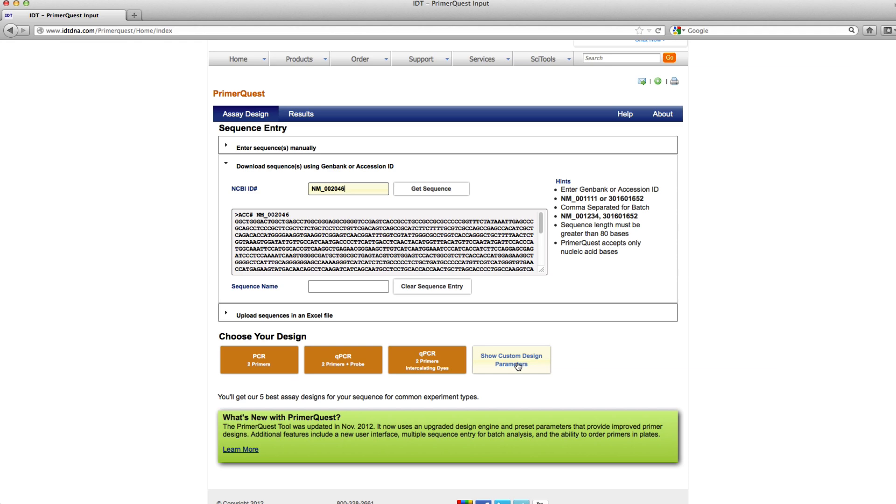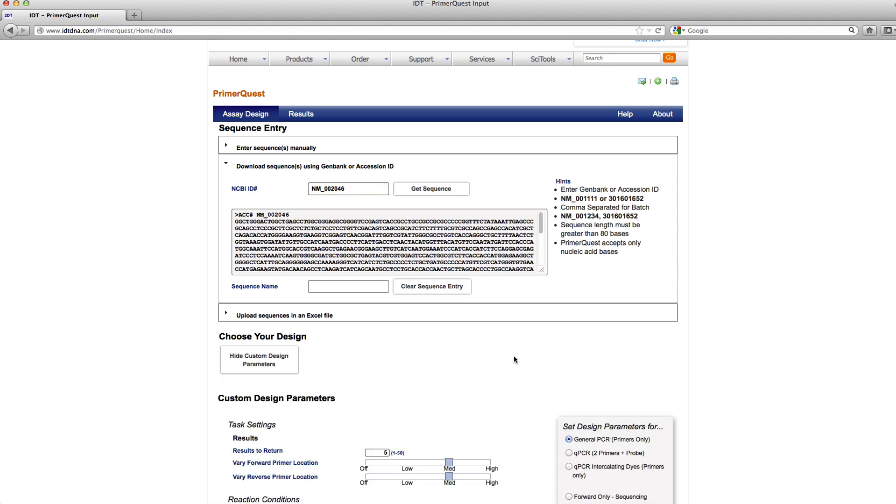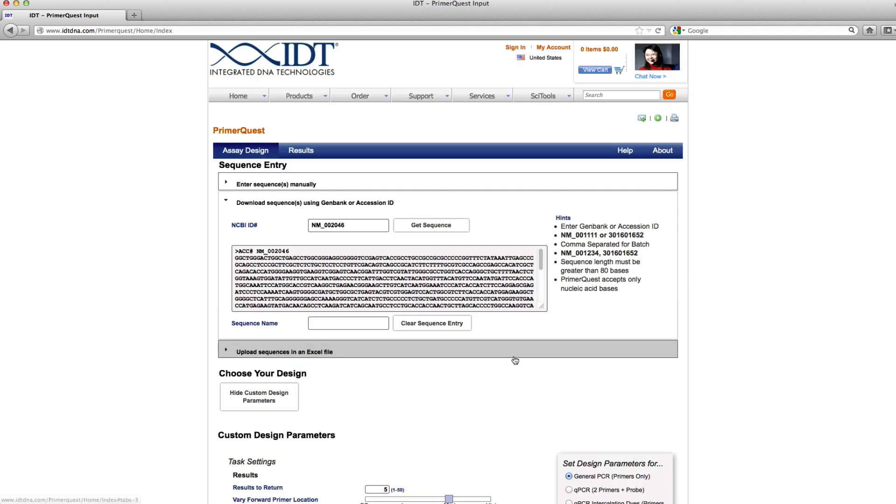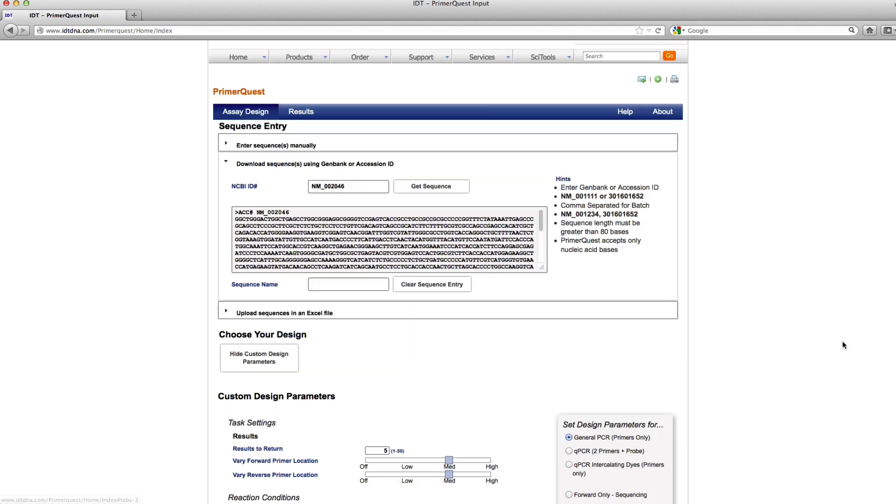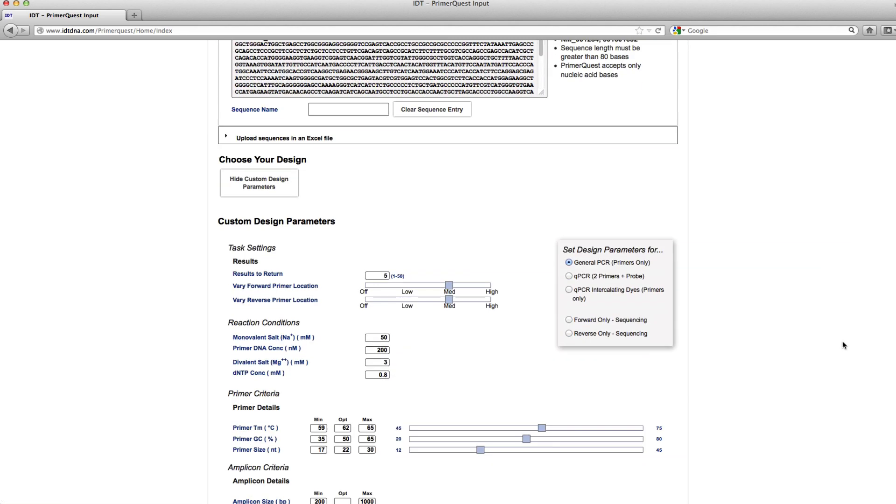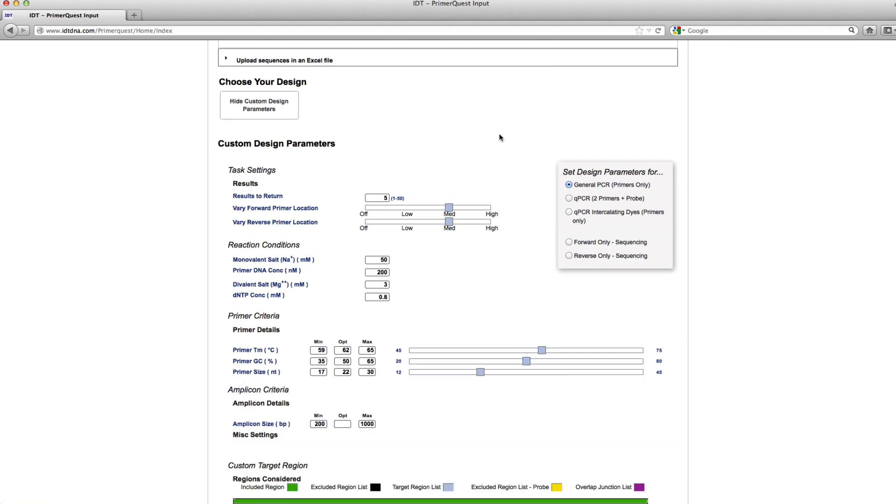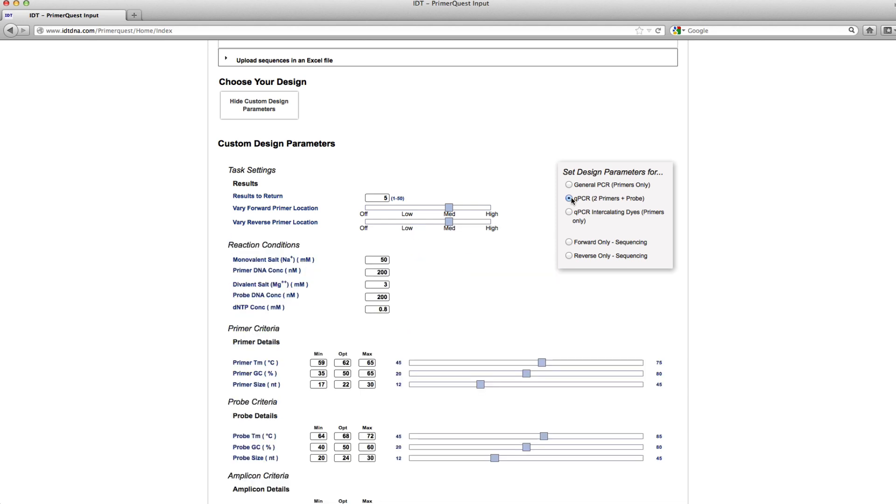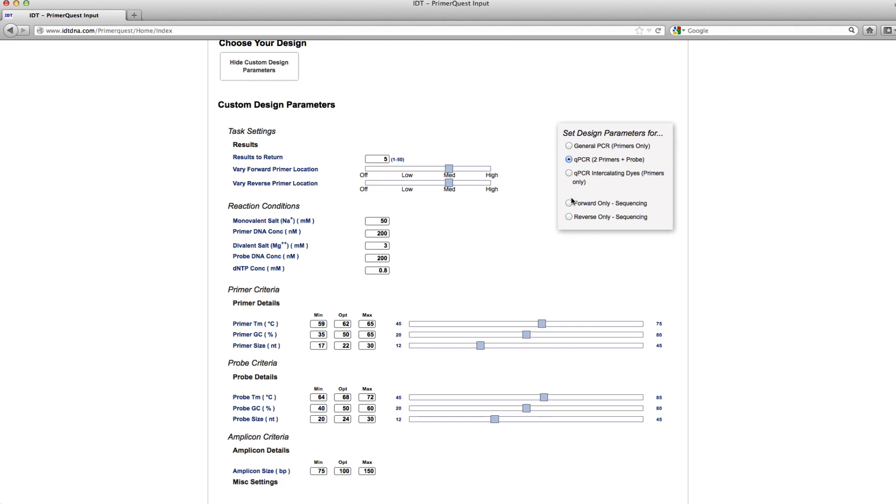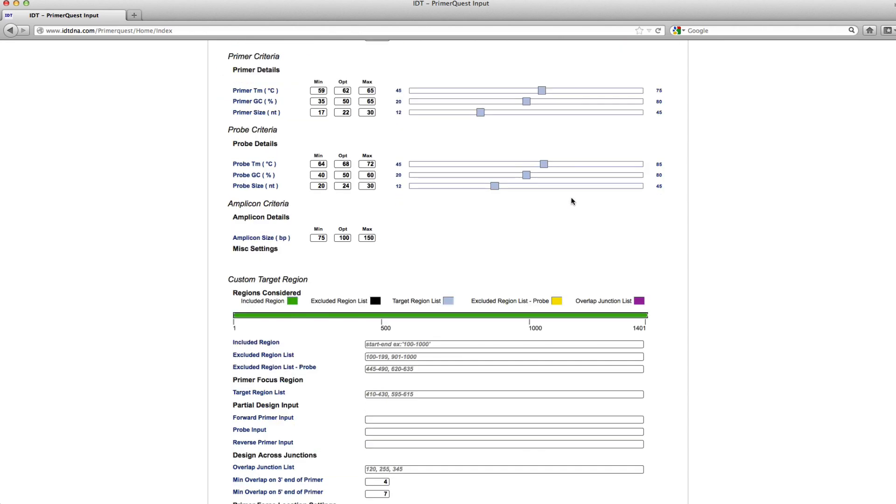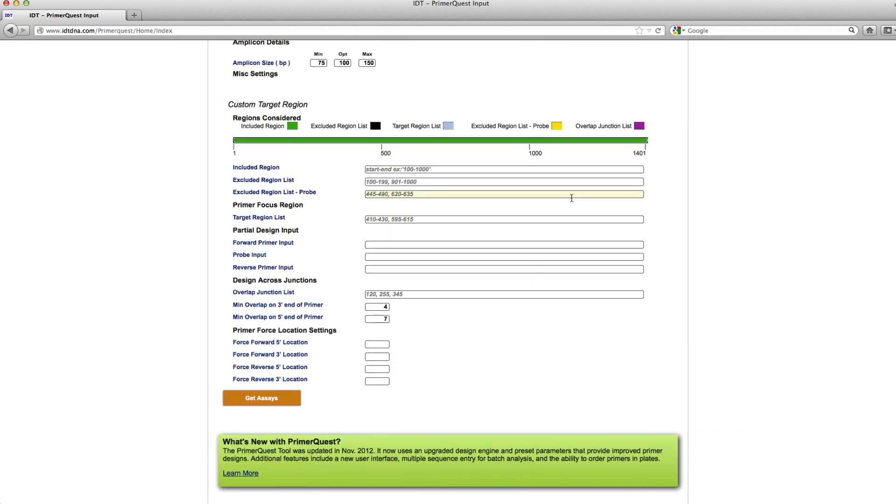In order for me to enter those primer sequences, I first need to choose this show custom design parameters. Since it defaults to general PCR, I'm going to switch this over to qPCR just to make sure I can also see the probe information and so that the tool knows it needs to design a probe for my two primer sequences.